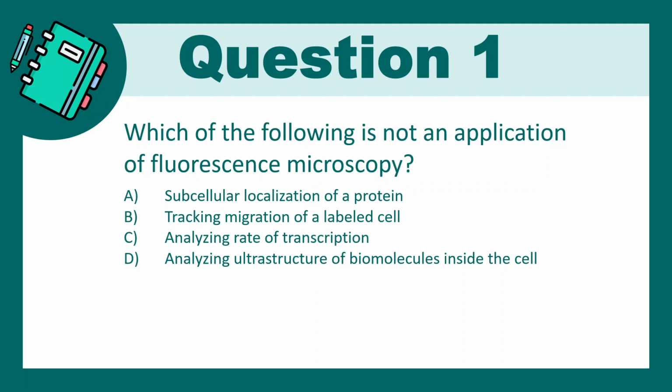Correct answer is option D, because analyzing ultrastructure of biomolecules can be done using NMR, mass spec, maybe all the X-ray crystallography, these kind of biophysical technique. We cannot use fluorescence microscopy to do that.